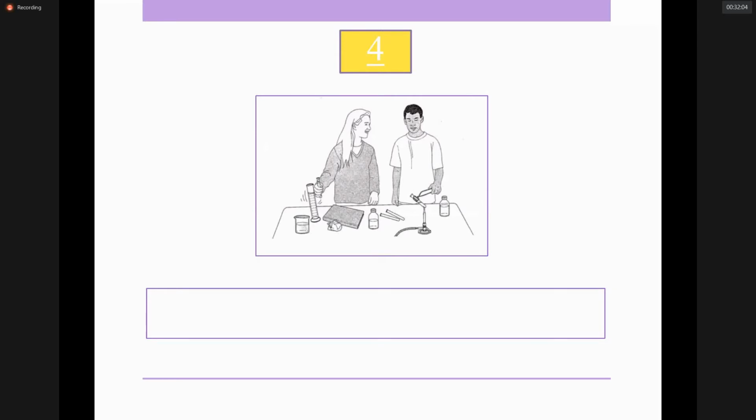طيب number 4. This scene is about 2 chemists in the lab with the wrong practices or precautions that we can mention. They are not wearing lab coats. Yes, يا جود صح. They are not wearing the lab coat or the protective equipment, right, Sukaina? Second, as Jude said, she's not focusing, she's talking while she holds the tube, and she will accidentally spill the liquid in the cylinder.